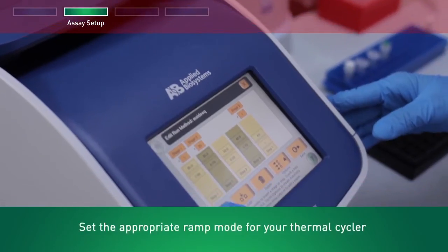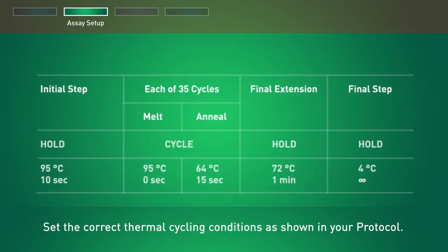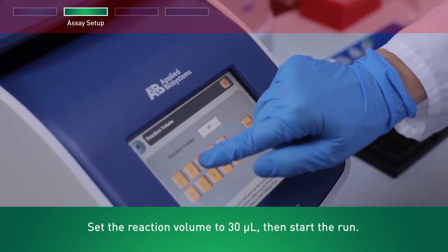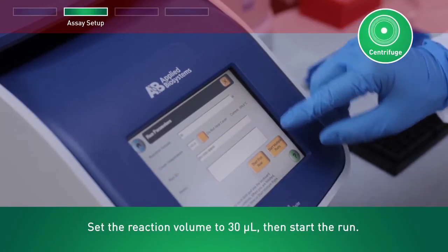Set the appropriate ramp mode for your thermal cycler. Set the correct thermal cycling conditions as shown in your protocol. Set the reaction volume to 30 microliters, then start the run. After the run, centrifuge to collect liquid.